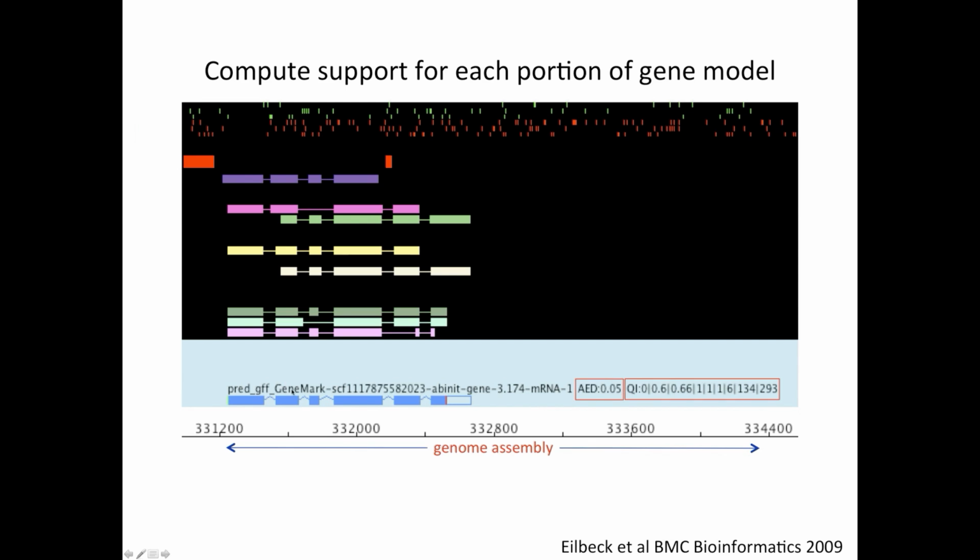And that's the intron exon structure for that mRNA. It'll add the UTRs, even though the gene predictors typically don't give you that kind of evidence. Maker can look back at the aligned evidence and add the UTRs for you if there's evidence for it. In this case, on the 5' side, we didn't have the evidence for it, so nothing gets out.